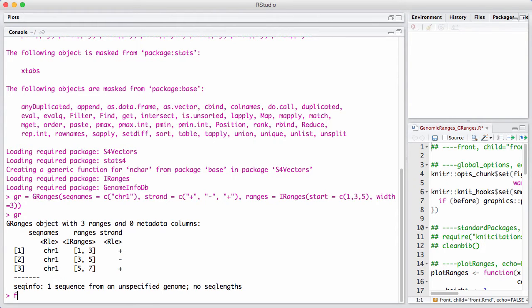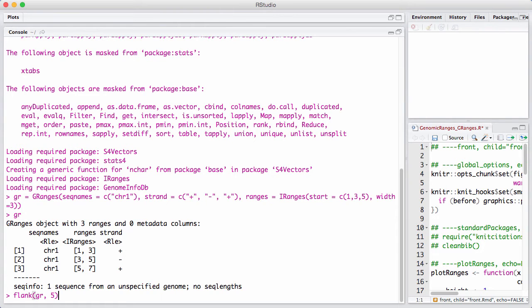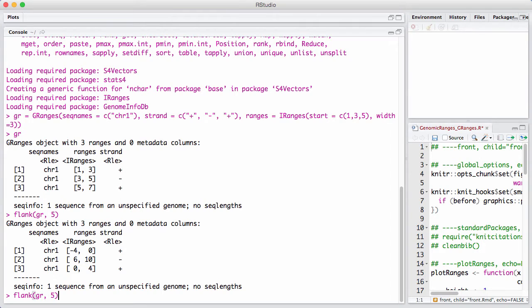We can do things such as get the flanking sequence on the GRange. And you can see here that the flanking sequence is relative to the direction of transcription. So something happens on the positive strand where we go to the left, whereas on the negative strand we go to the right.